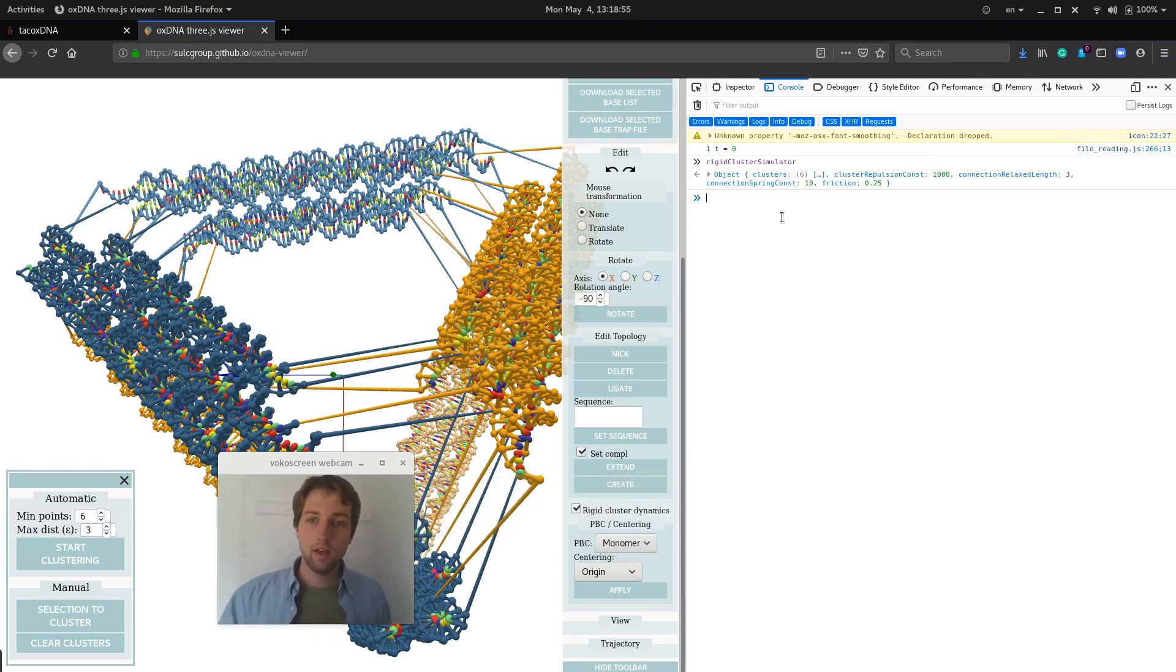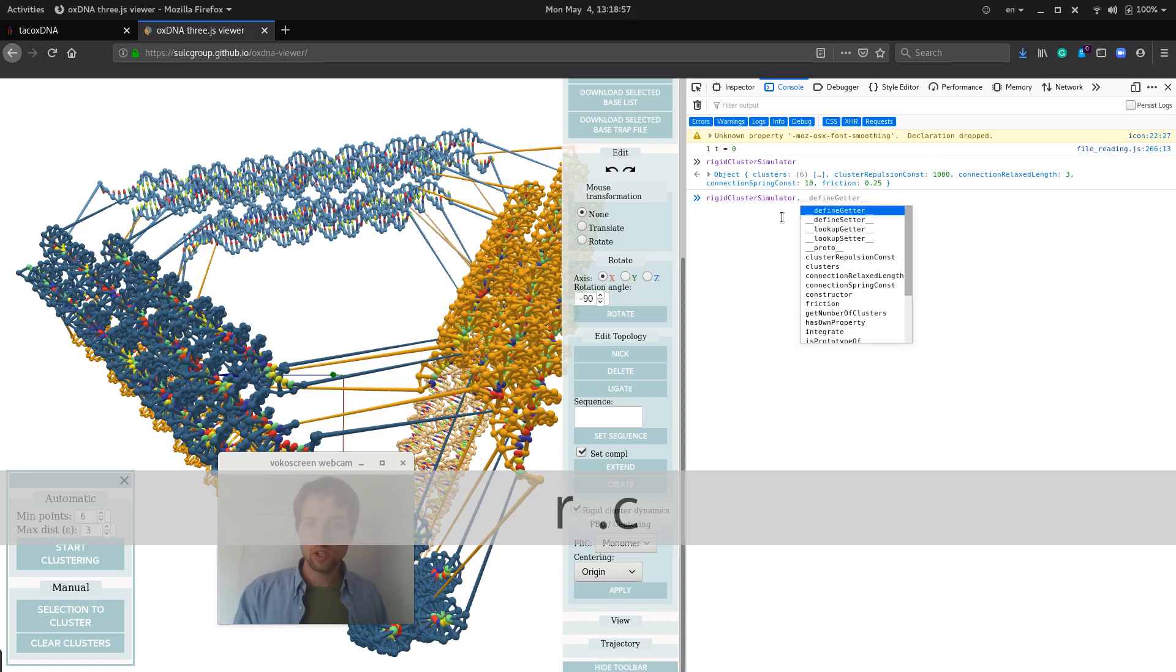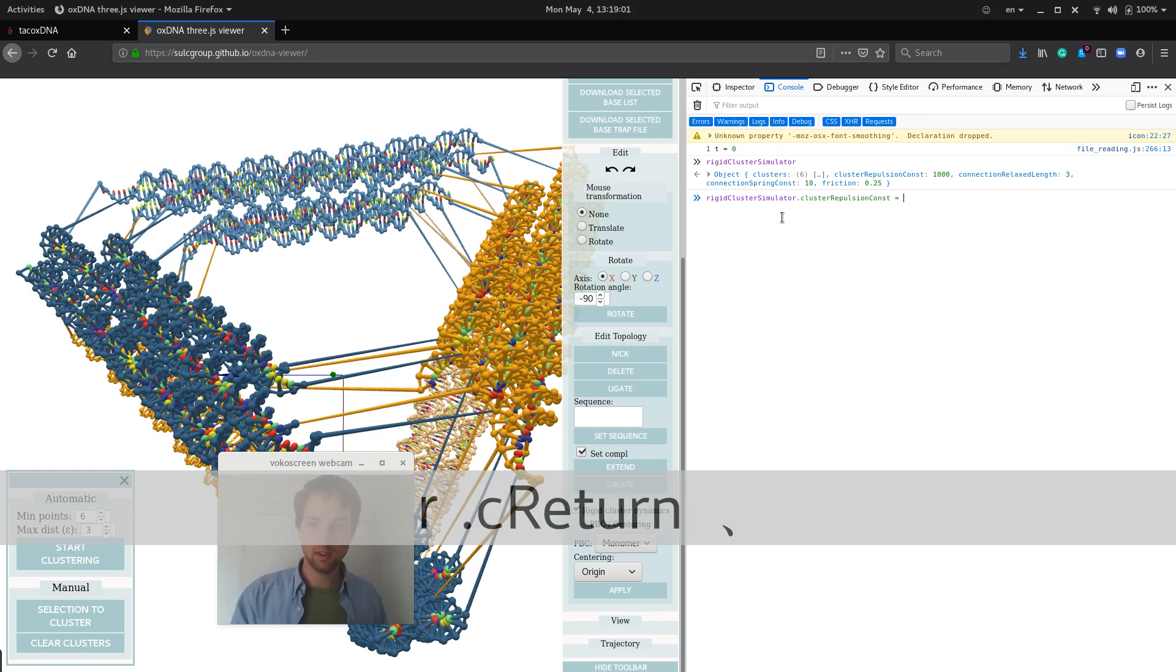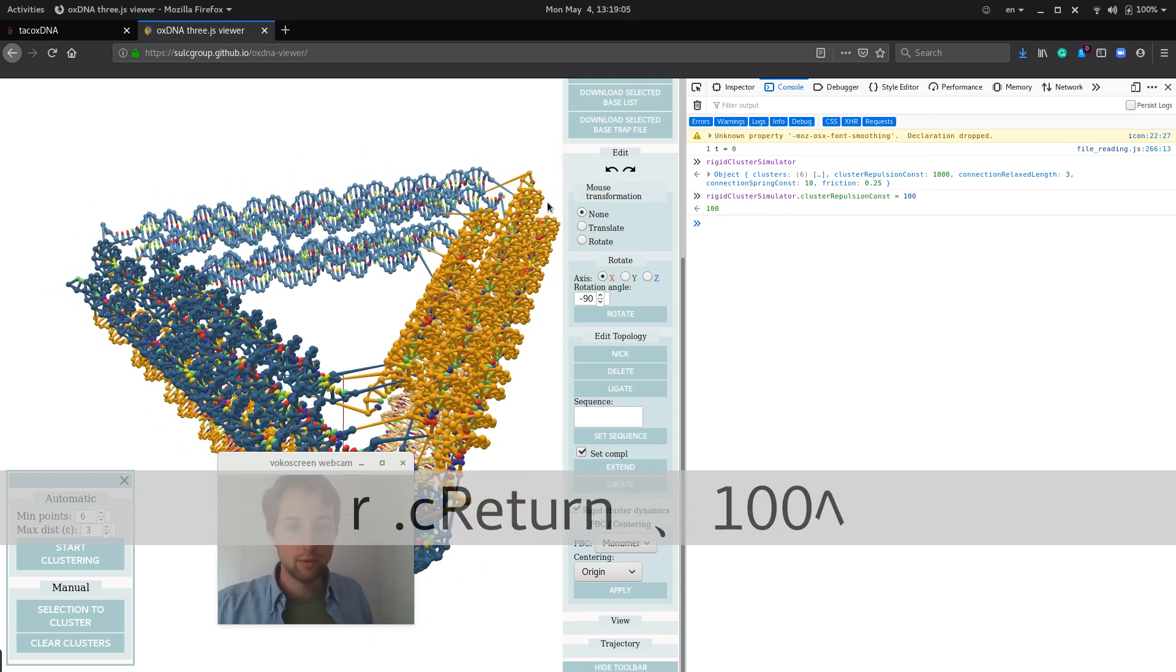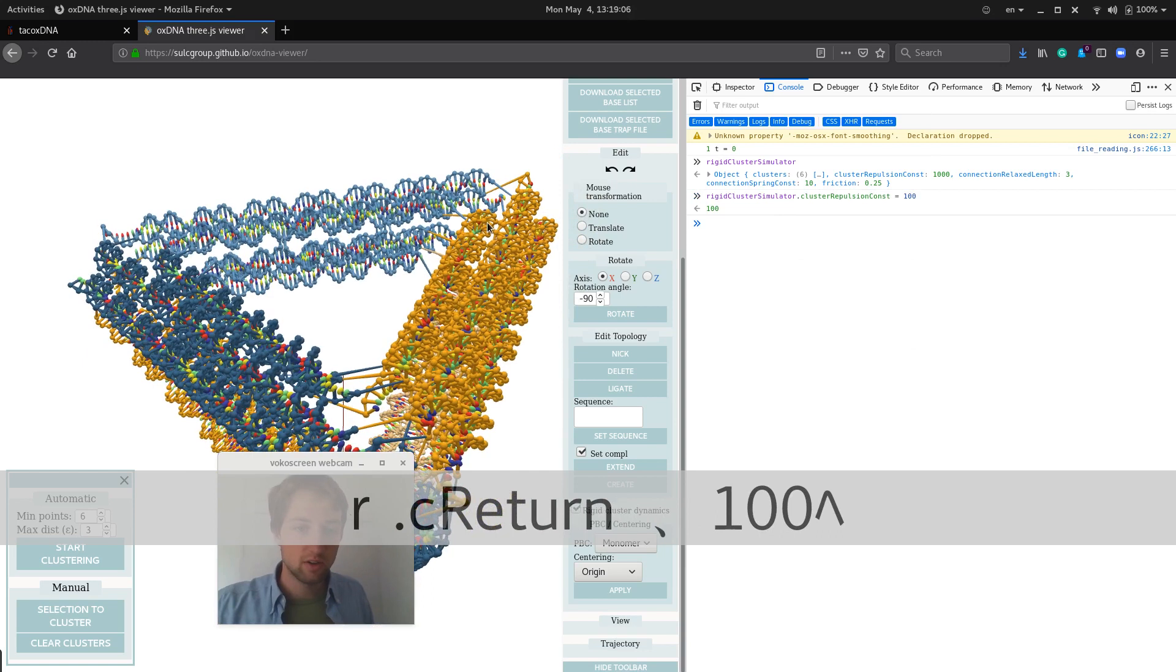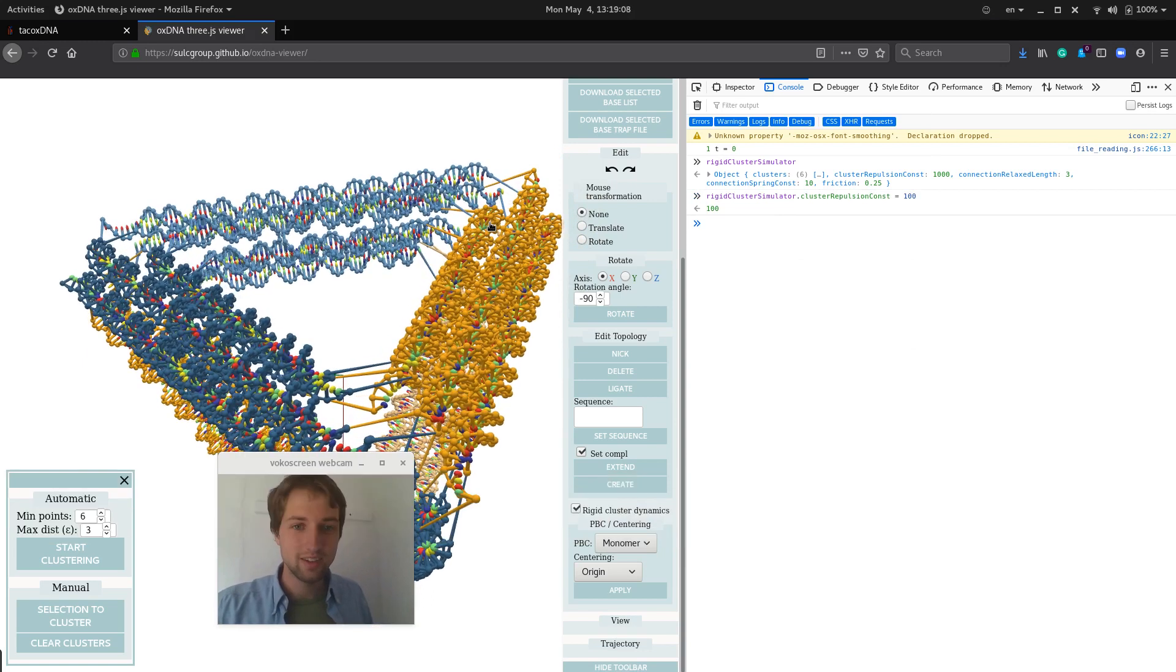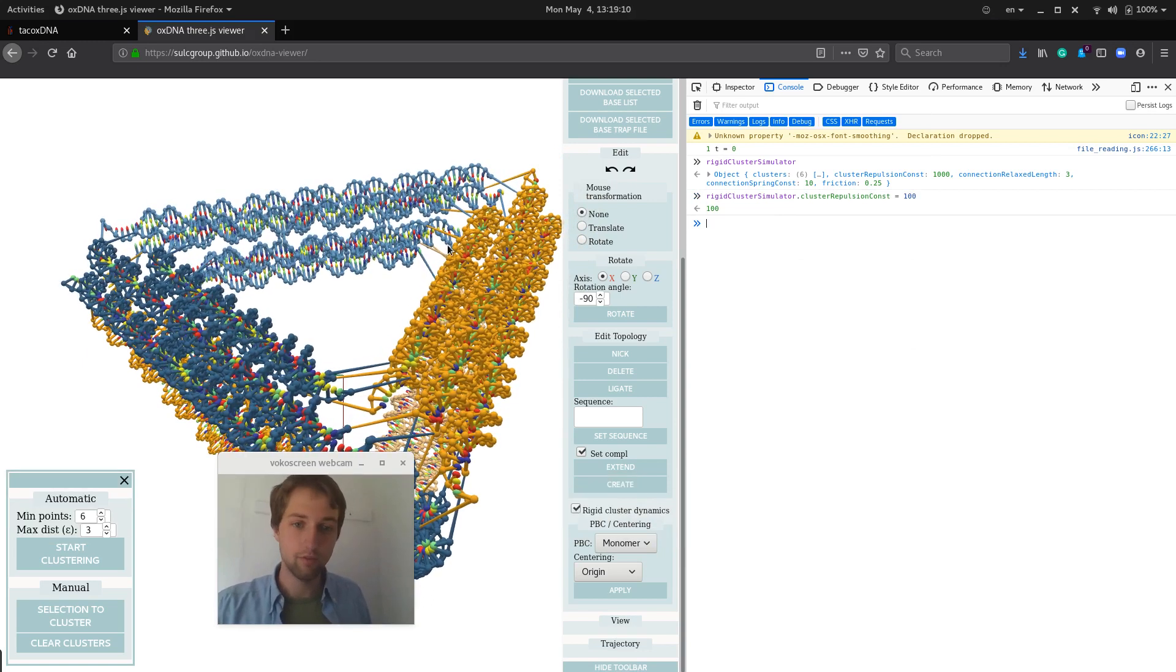And if you choose to change either of those, say the repulsion constant, you can set that to 100 instead, then you will get a much more tight structure that will relax even faster in OxDNA.